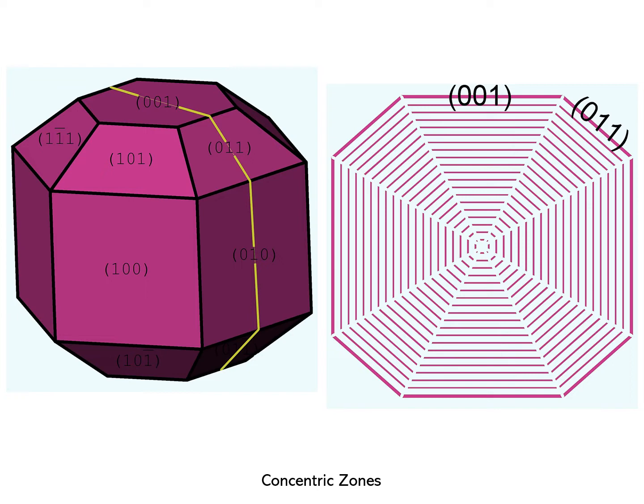These zones also have a crystallographic implication as they follow the orientation of crystal faces. So that's what you're seeing in this diagram, where an apatite crystal has pinacoid, prism, and dipyramid forms. This slice through that shows concentric zoning core to rim, where the zones actually also show the boundaries between adjacent sectors, which are marked between the breaks in the zones there.